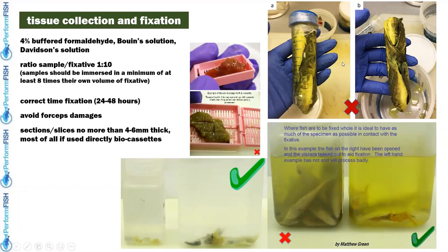In order to obtain a good histological specimen, the fish tissue must be very fresh and immediately transferred into a fixative solution in order to avoid autolysis. A good fixation is the most important step in producing good histologic slides. A proper histological evaluation depends absolutely on an excellent tissue fixation.